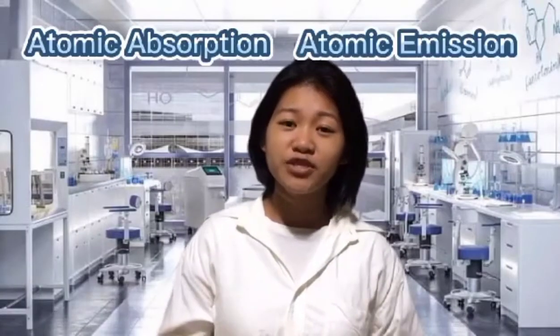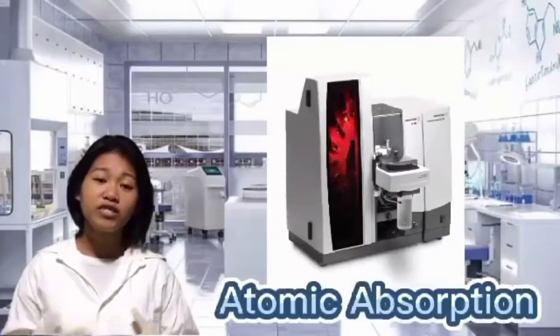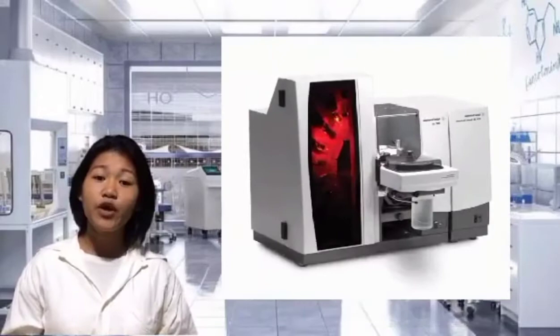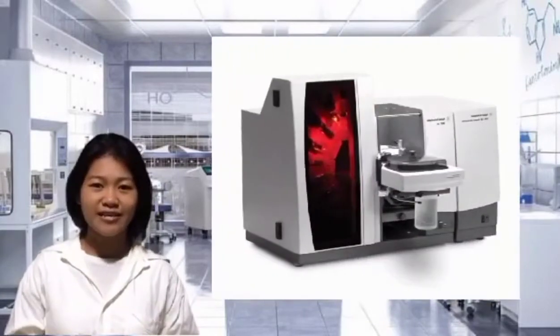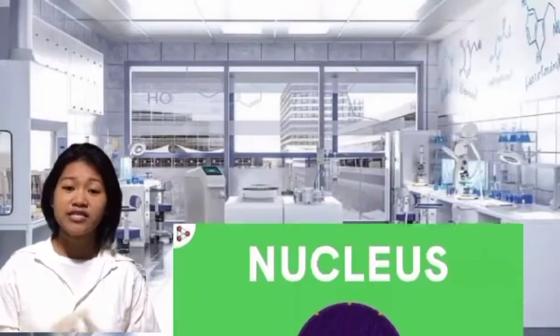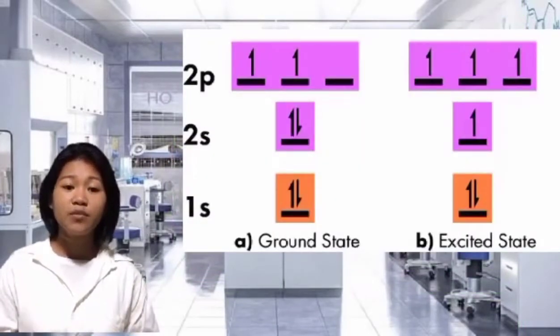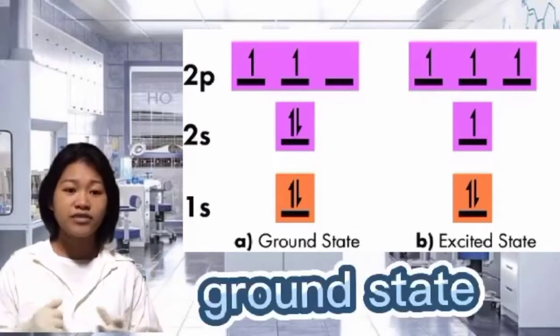Now let's proceed with atomic absorption and atomic emission spectroscopy. All atomic absorption instruments are capable of measuring both atomic absorption and atomic emission. It is important for the operator to understand the processes that occur in each technique. Every element has a specific number of electrons associated with its nucleus. The normal and most stable orbital configuration of an atom is known as the ground state.